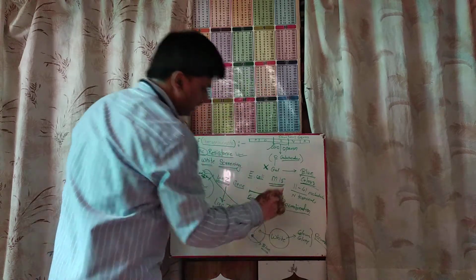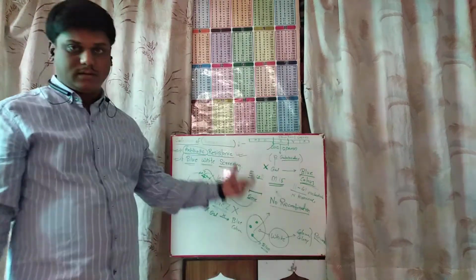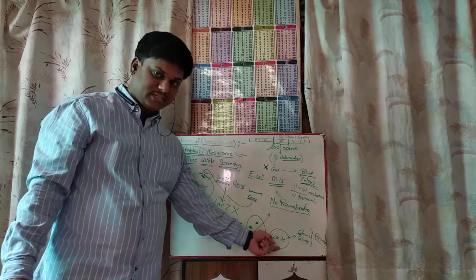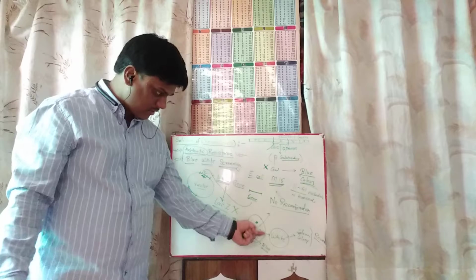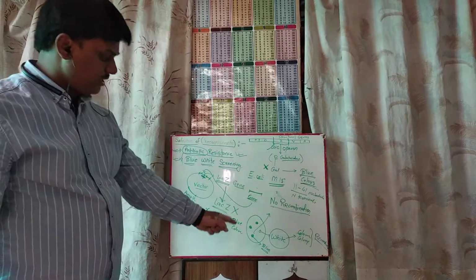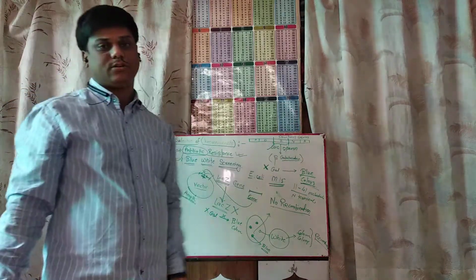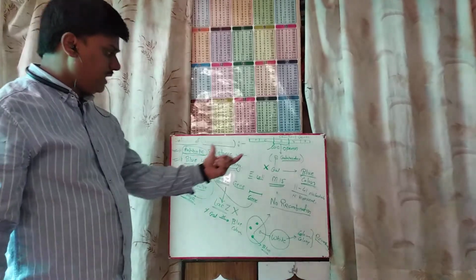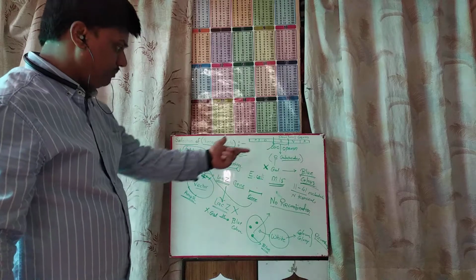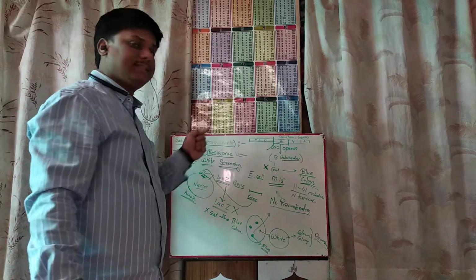So if we screen recombinants on ampicillin medium, then the colonies which have the white appearance are called recombinants, while the colonies which show the blue color are called non-recombinant colonies. So in this way we can easily identify the recombinant with the help of the beta galactosidase strategy, that is what we call blue-white screening.